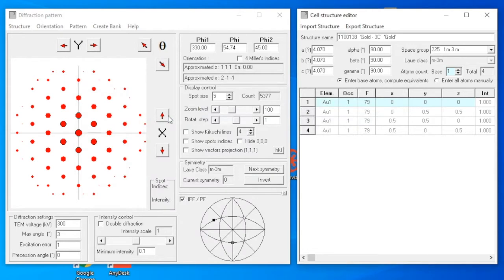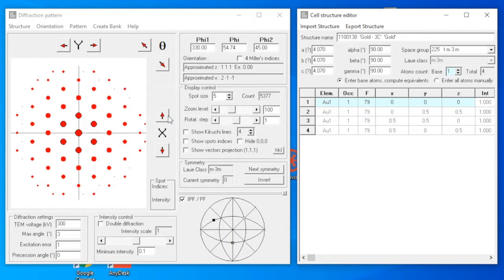I want to add a very quick note here. The A-STAR topspin software comes with a database, so most of the structures you work on will be in the database. If you work on a very novel structure which does not exist in the database, you can always create the cif file then import it.